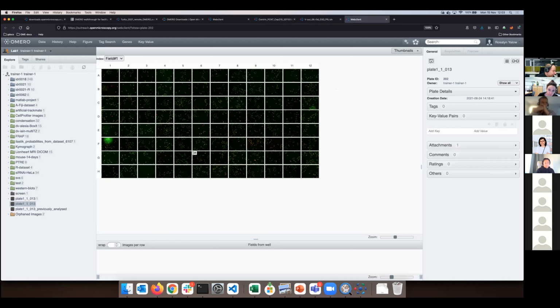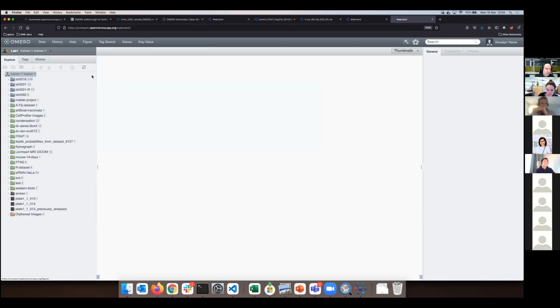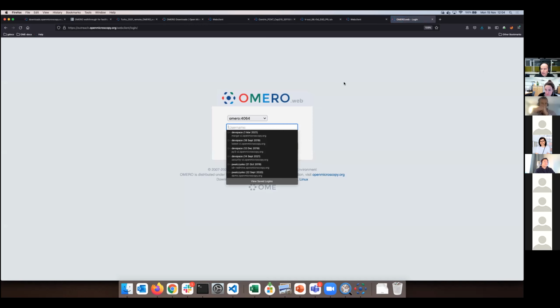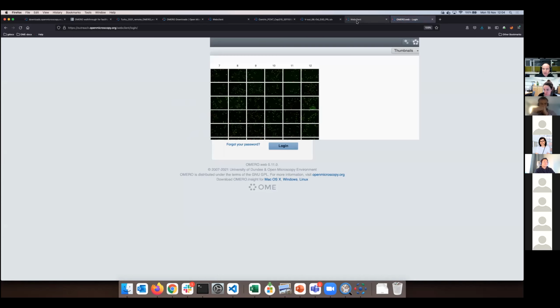Yeah, it's again the choice of Joanna and the IT. But if it is a public link, this means that from any place in the world, anyone can type into their browser this outreach.openmicroscopy address, and they will navigate to this page. Okay, but then they will be stopped, of course, because they don't have any credentials, they don't have an account on that Omero server. Okay, and now you are asking if such a person doesn't have an account on the Omero server, how do I go about that? How do I show him or her the data which are in the Omero server, say displayed?